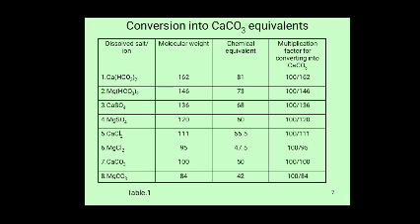Conversion into CaCO3 equivalent weight: dissolved salts, molecular weight, chemical equivalent, multiplication factor for converting into CaCO3.